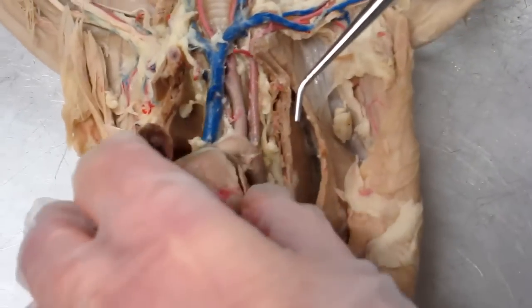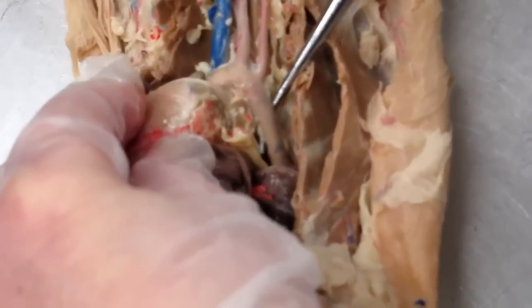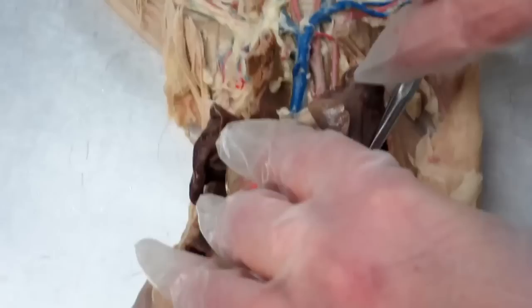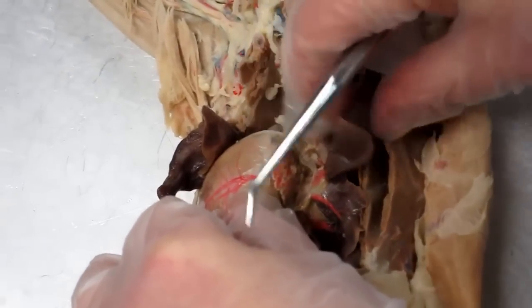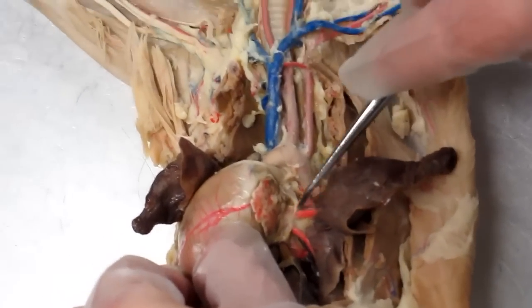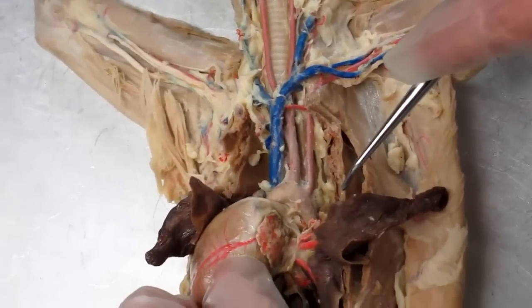If you're looking on the left side of the heart, that's where you can see the descending aorta. Okay, and on this cat, because of the way the injection worked, you can also see some branches of the pulmonary veins where you see this pink here in the lungs. Those are pulmonary veins.